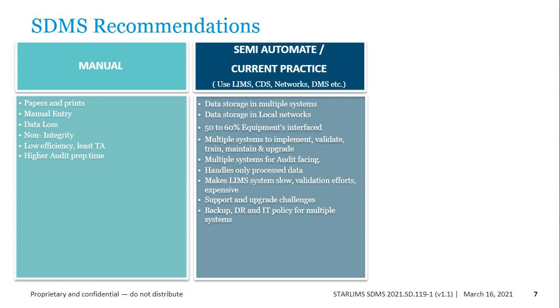And also, since I already covered this point, you dump most of these files as they come out of the equipment and then straight away push them into LIMS, and predominantly the LIMS systems are slow and they suffer when you scale up at a global scale, or when you implement it across your organization at enterprise scale. These systems tend to die both in terms of performance and response time. That's one of the major challenges with local or global LIMS systems today.